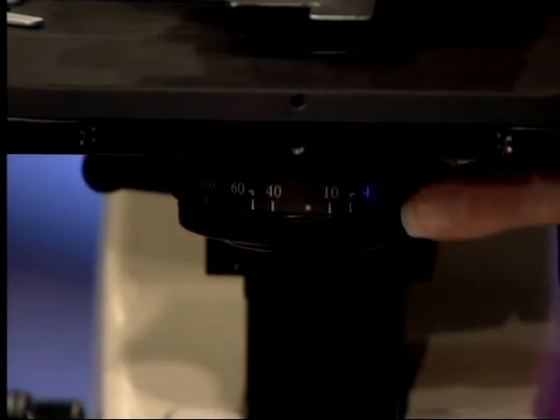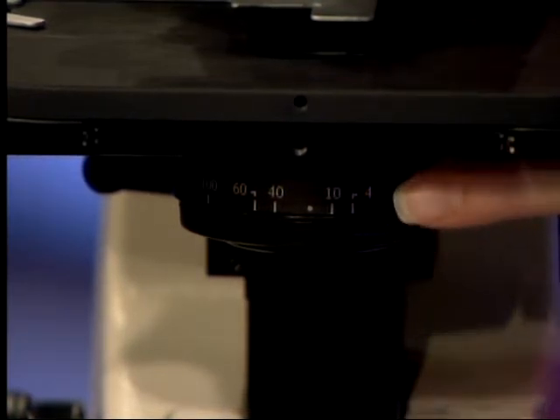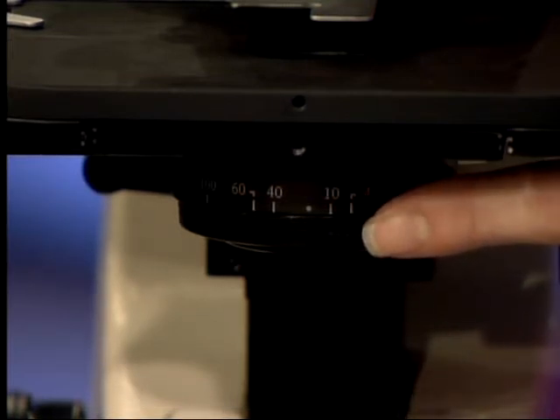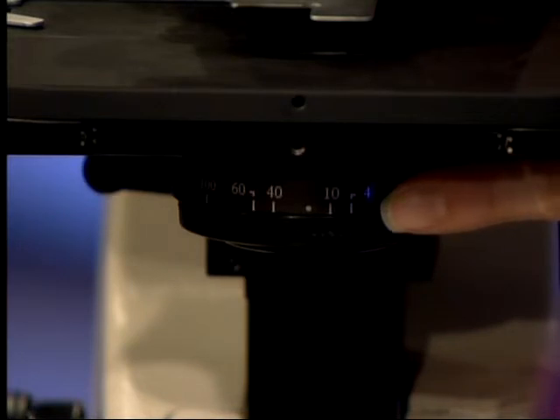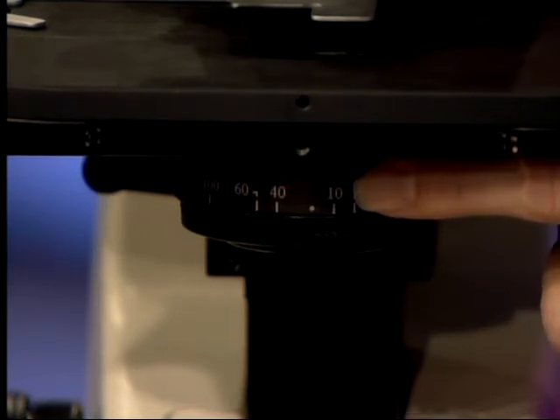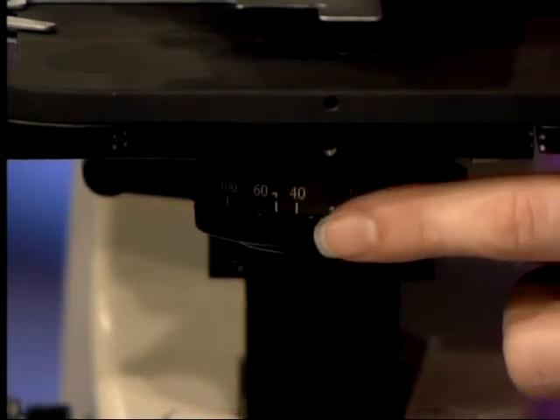On the front of the condenser you will see a scale with numbers: 4, 10, 40, 60, and 100. These numbers correspond to the objective you are using. It will open or close the iris inside the condenser to let in or reduce the amount of light coming through from the light source. When using the 10x objective you will get the best illumination by setting the condenser to the 10 mark. When using the 40x objective, set the condenser to the 40 mark.